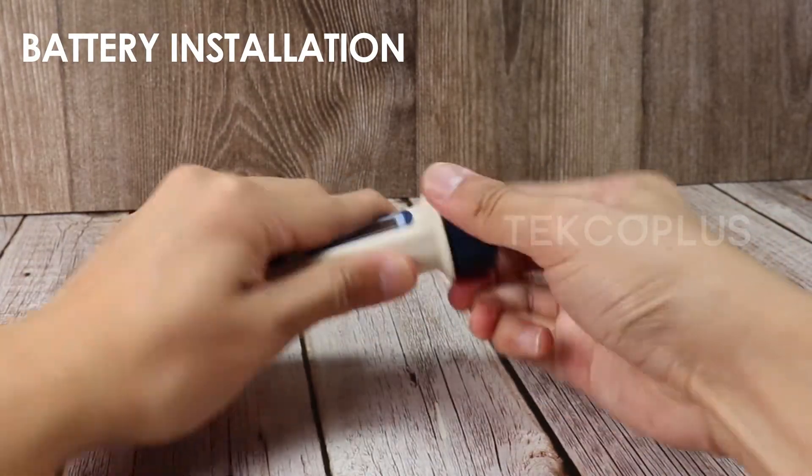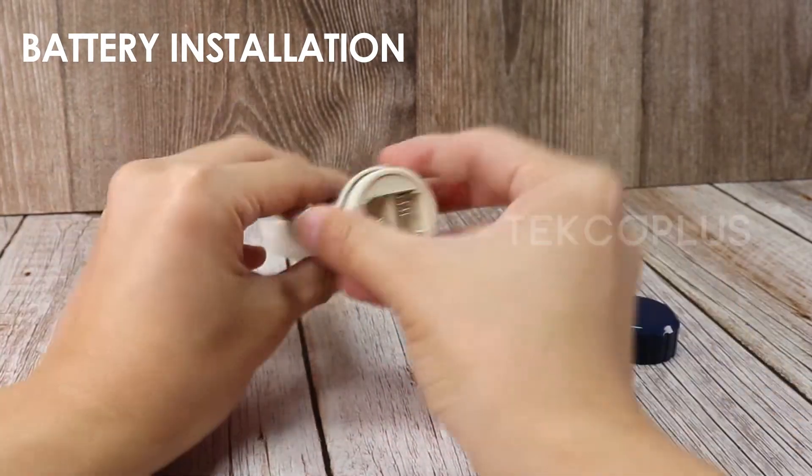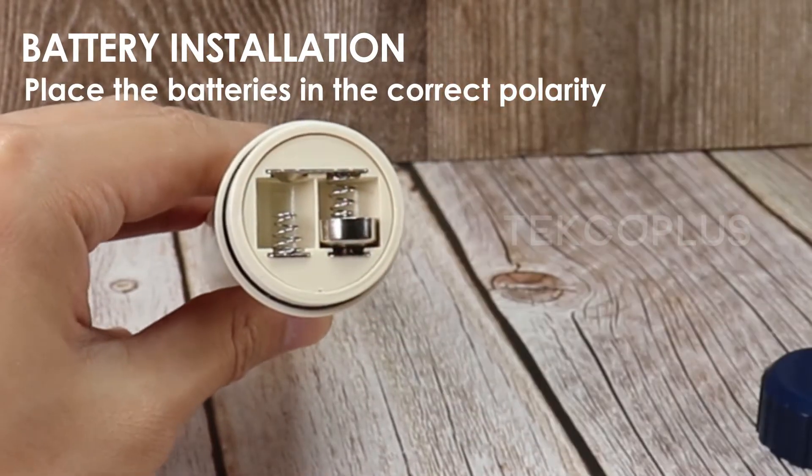To operate, install the four button batteries. Place the batteries in the correct polarity.